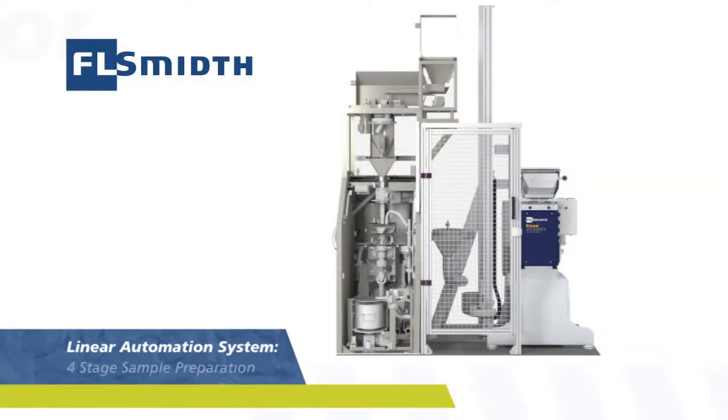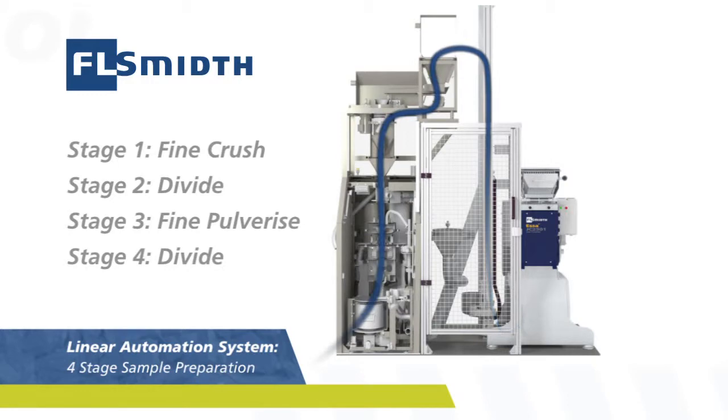The LAS402 linear automation system offers many of the benefits of robot-based automation cells at a fraction of the cost. And because it's designed and built by FL Smith, you can be sure it will perform to specifications.